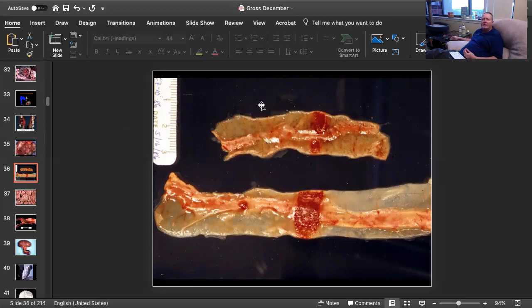And birds, or waterfowl, they don't have lymph nodes per se, but they do have these large Peyer's patches. And they are circumferential around the gut, very selective. And there are certain diseases that hit the lymphoid tissue first before they start to lay waste to the rest of the intestine. And one of those is anatid herpesvirus type 1, which causes the disease of duck viral enteritis or duck plague.